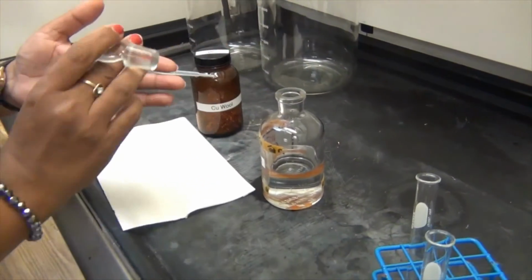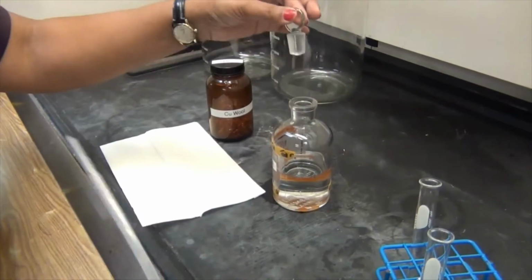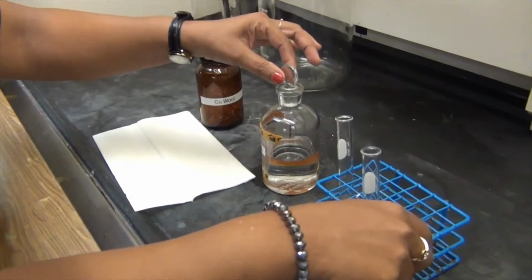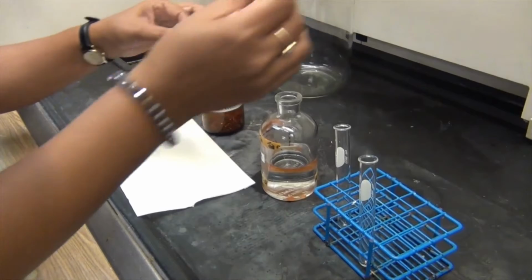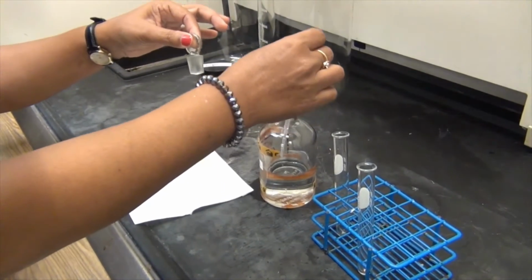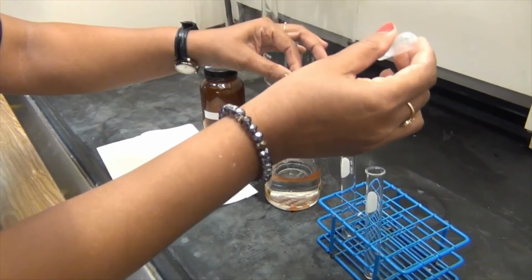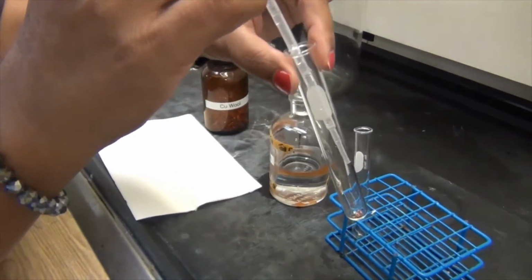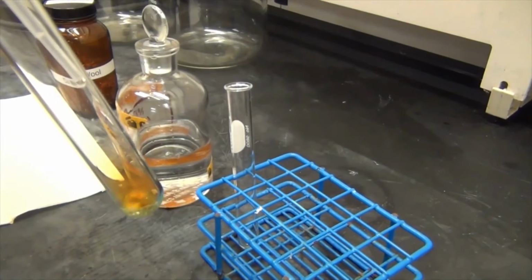And then you use a pipette. You can use your same hand, and if you're not comfortable, then you can use the other hand, okay, as you wish. I'm going to use the other hand right now because my test tube is over here, so that way you can also clearly see what's going on. So I'm going to take a little bit of the nitric acid, and I'm supposed to add enough to just react all the copper in there, okay? So I'm going to add this drop by drop, and you can see what happens.